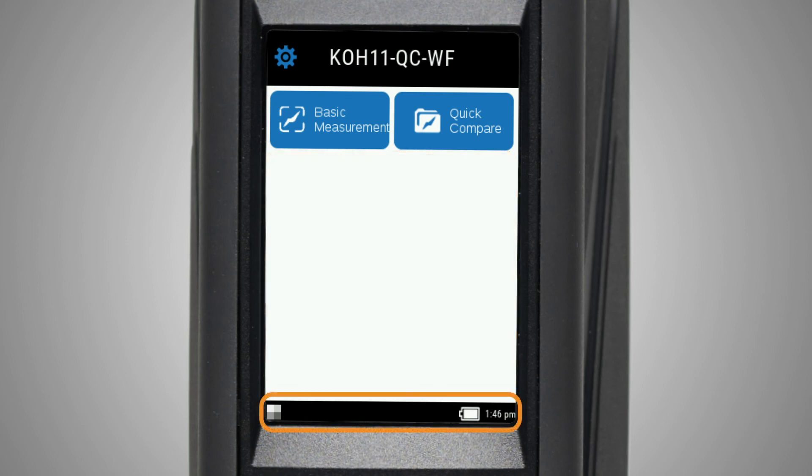Finally, the footer bar shows your calibration status, wifi connection status, remaining battery, and the current time.